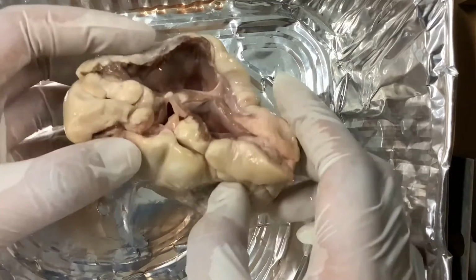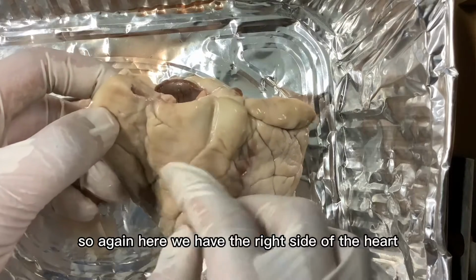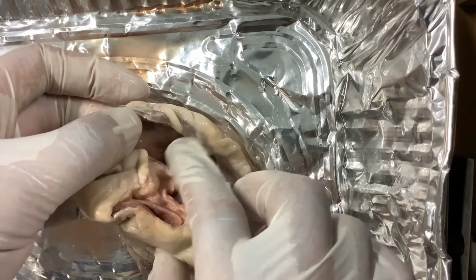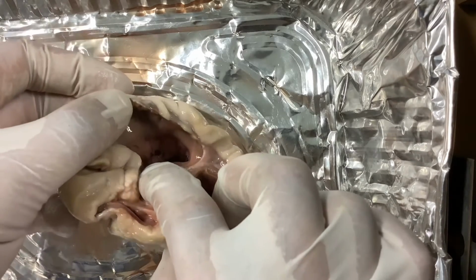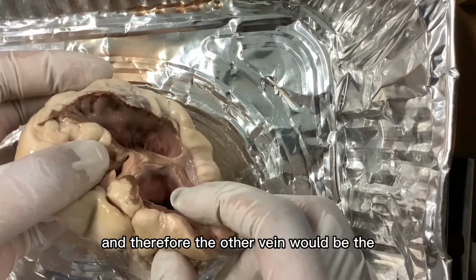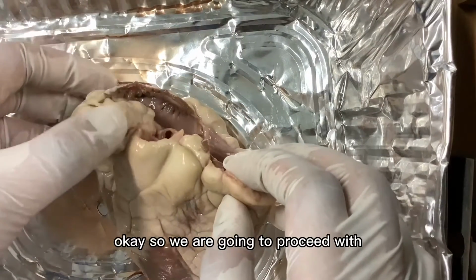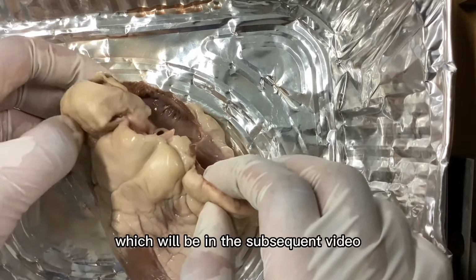Just to help you identify the veins and arteries, here we have the right side of the heart. Therefore, this vein is on the right side of the heart. What would be the name of this vein? Yes, this is the vena cava. And the other vein would be the pulmonary vein here. We are going to proceed with investigating the flow of blood in the heart using water, which will be in the subsequent video.